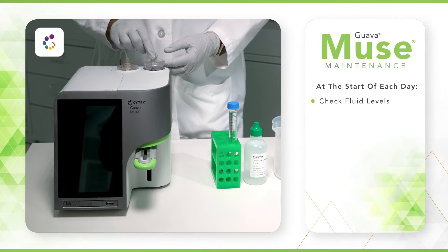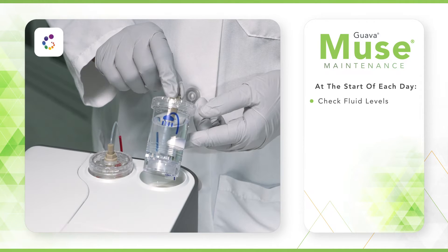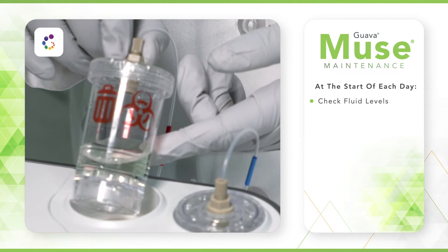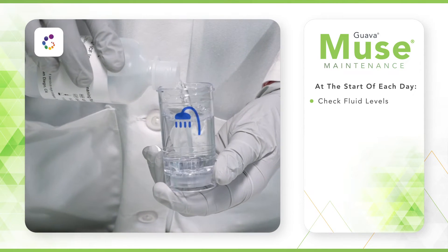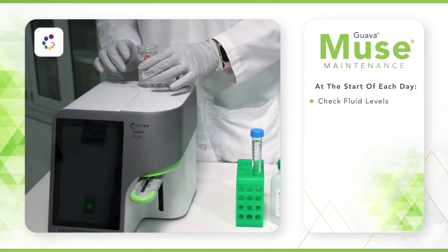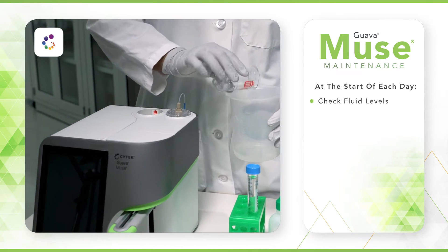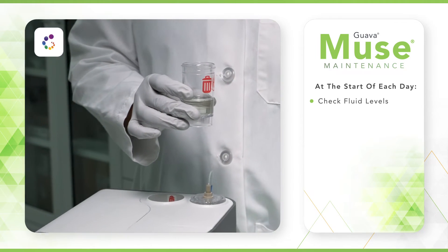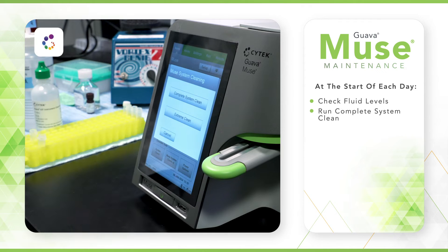At the start of each day, prior to running your first Muse assay, check the fluid levels in both wash and cleaning bottles and adjust as necessary. Fill the cleaning bottle with ICF if necessary. Empty the waste bottle, then add 10 milliliters of bleach. Then run a complete system clean.